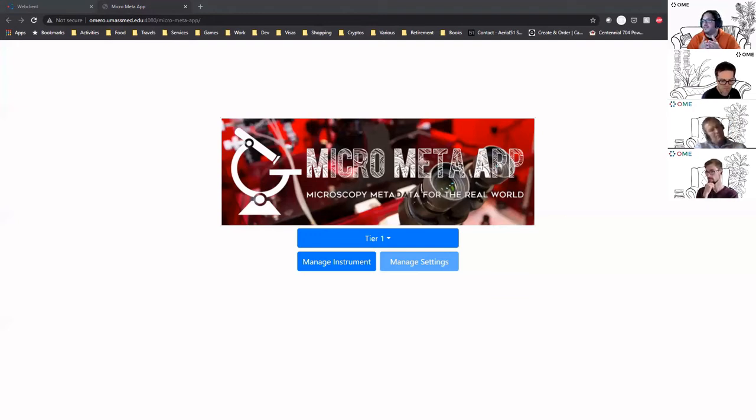It would be nice, in a following development cycle, to be able to create dictionaries of values that one field can be filled with. For the moment, we have dictionaries for some fields. You saw that there are some fields that are drop-down menus. But the other information is numbers, for example. If the number doesn't come from the metadata, there are really no other ways of retrieving the data.